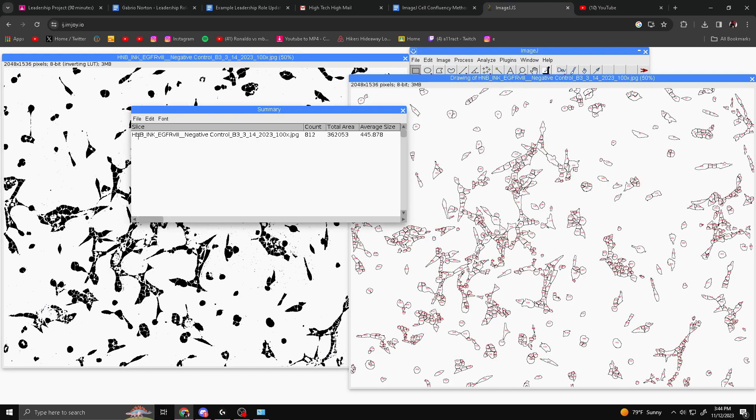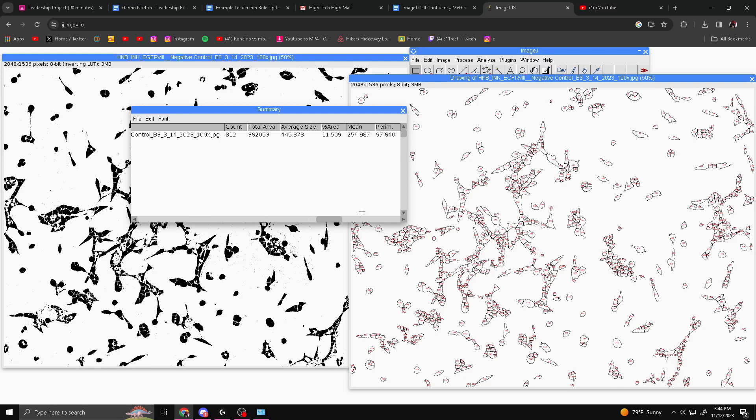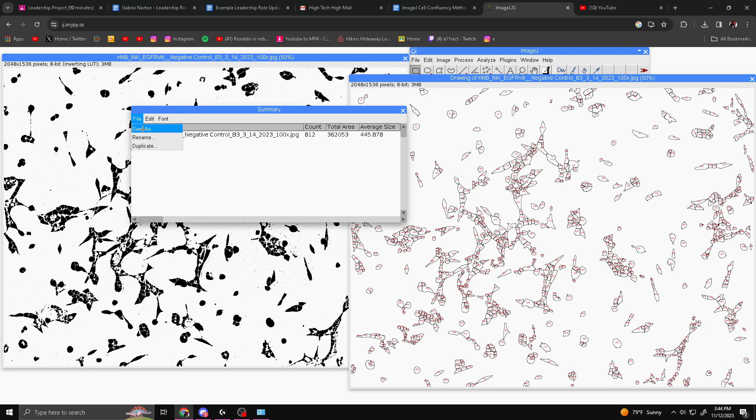As you can see where it comes up here, you have the count, the total area, the average size, the percent area, the mean, and all the stuff we checked off earlier. Now what you're going to do is you want to go to File, Save As, and then type whatever you need to. I'm going to name it number two, as I already did this before on my computer.